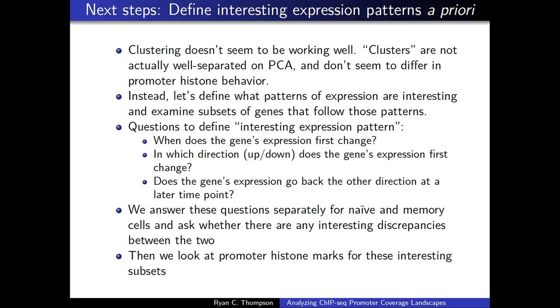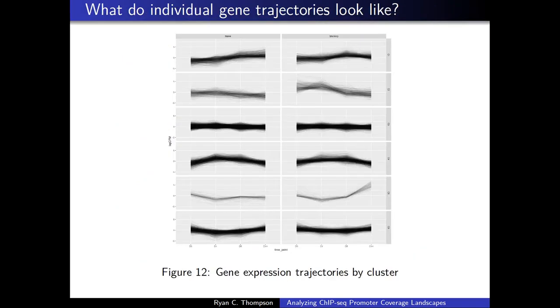Yeah, that's one possibility. I suppose I could also select for higher fold changes in the differential expression filtering. Yeah, because in the trajectory it's clearly a bunch of those genes all go in the middle, but then there are extremes, right? You could pull those out just based on fold change.